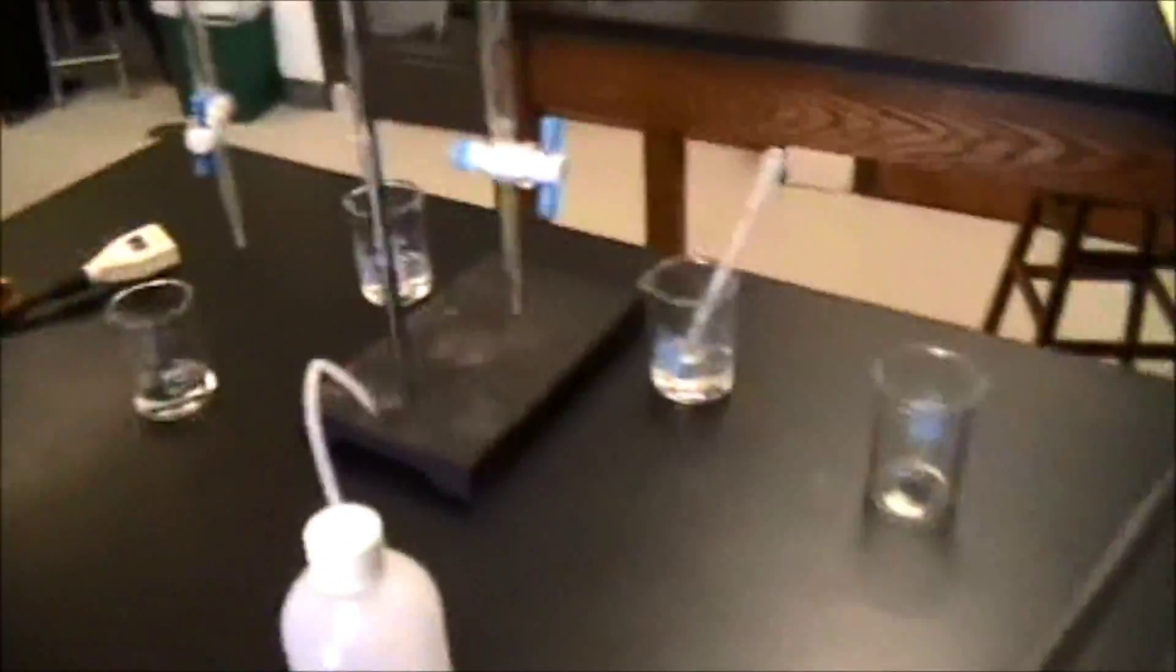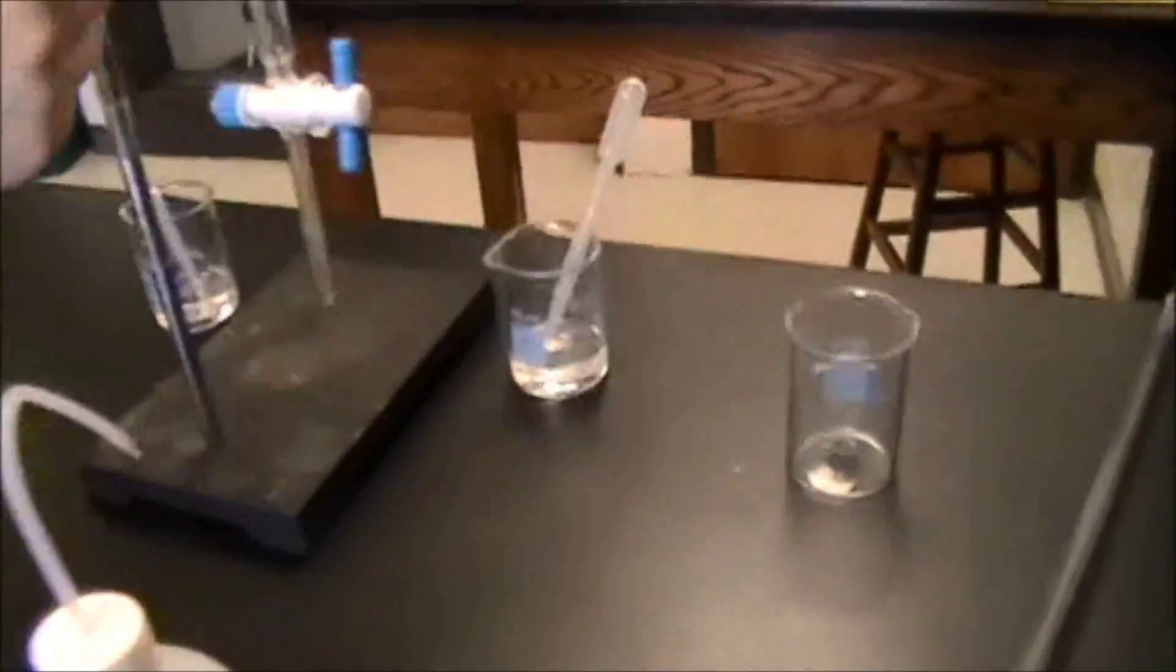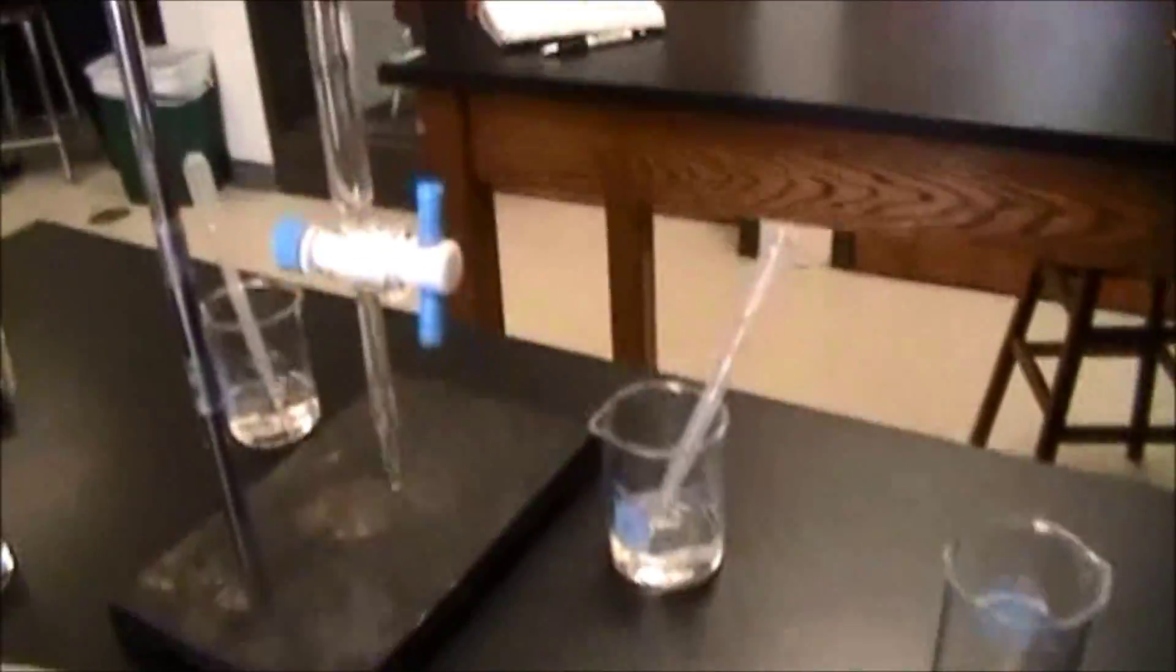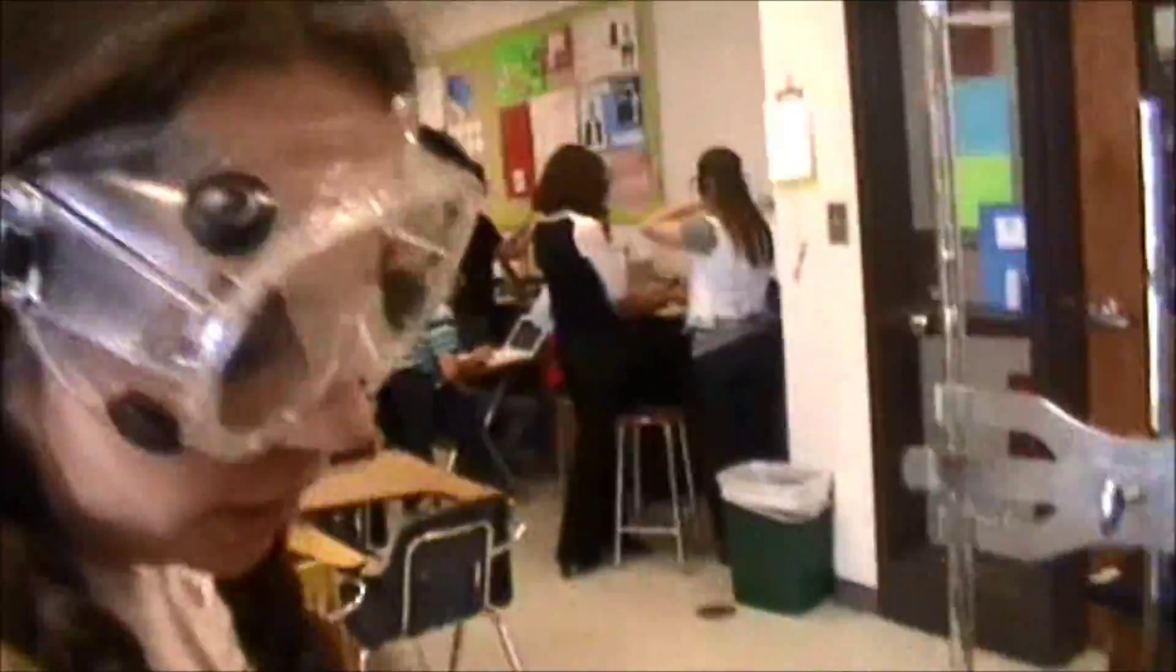What we're going to do is we're going to have our solution of our buffer solution, which is right there. Down here is our analyte. And then in here we're going to have HCl as our titrant. And we're going to add HCl to the analyte and hope that we will get our optimum buffering capacity.